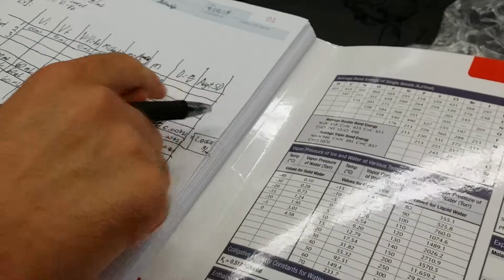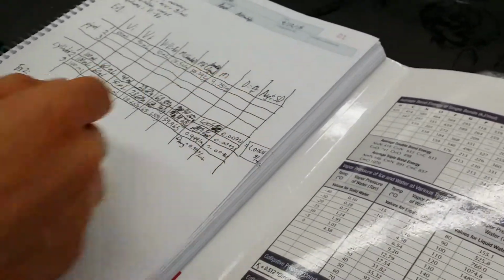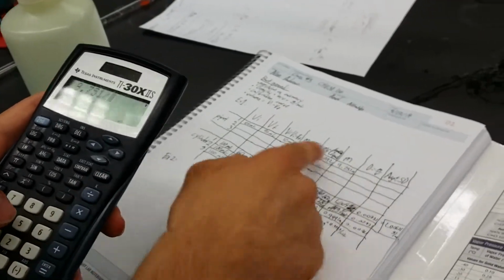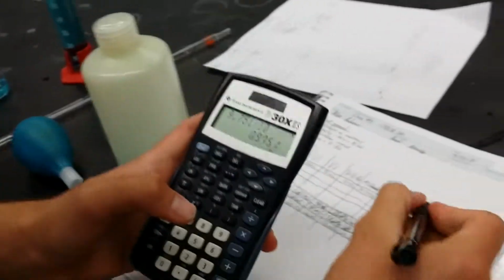Alright, so then we gotta find density by dividing the mass by the volume, which is 9.751 divided by volume, which is 10. And it's going to be 0.9751.